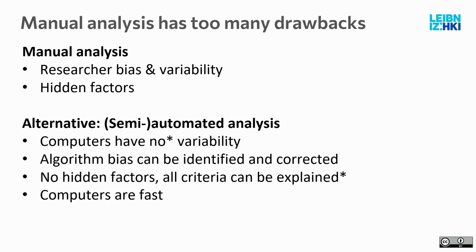in code. But then you have, as alternative, automated analysis methods, or at least semi-automated analysis methods that take some input from you. The computer will do it for you. And they mostly have no variability. There are some algorithms that have some random initialization, but let's ignore this. The computer will not be always correct with what it finds, depending on how you set up the algorithm. Sometimes you need some testing out different parameters, trying different approaches.